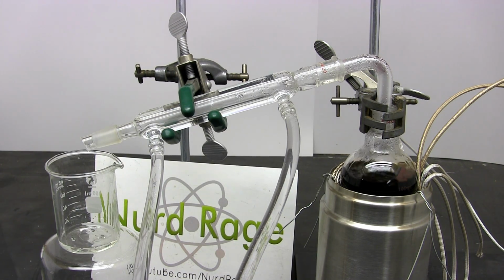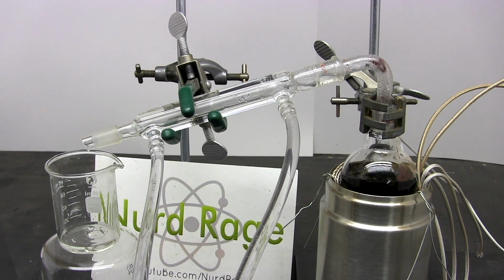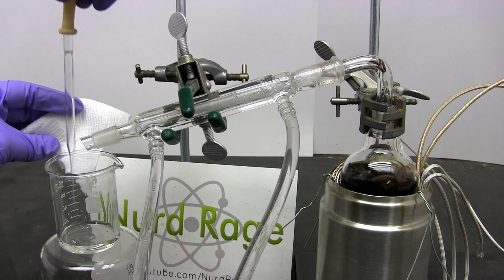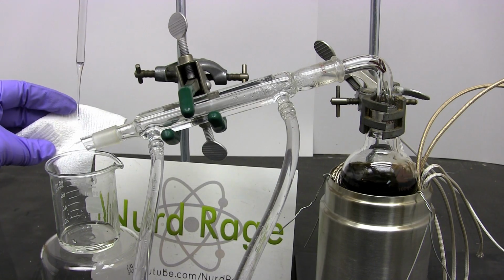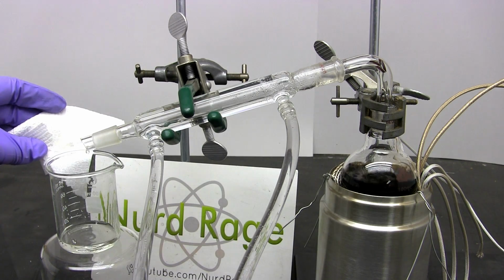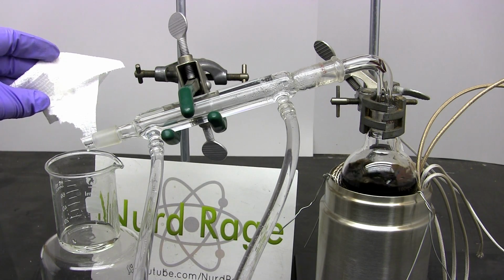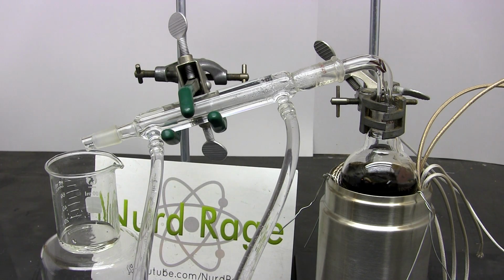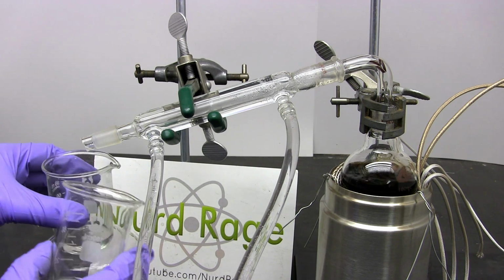The distillate will also have a small amount of acid, but this is rather dilute and not worth saving. We need to collect when the acid concentration is fairly high. A simple way to find out when the acid concentration in the distillate is high enough is to take a small sample and apply it to a tissue. If it's mostly water, then nothing will happen, and the tissue will just get wet. You can discard the distillate you've collected up to that point.